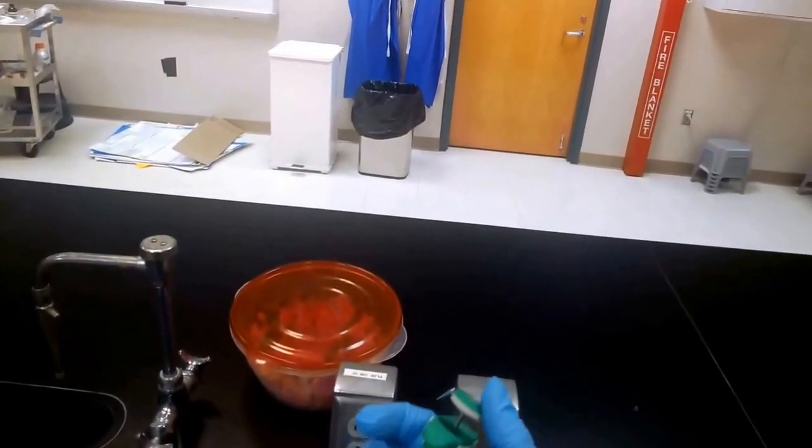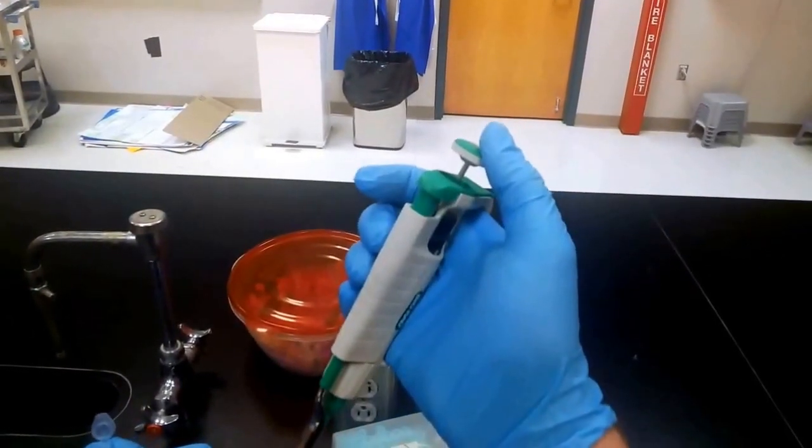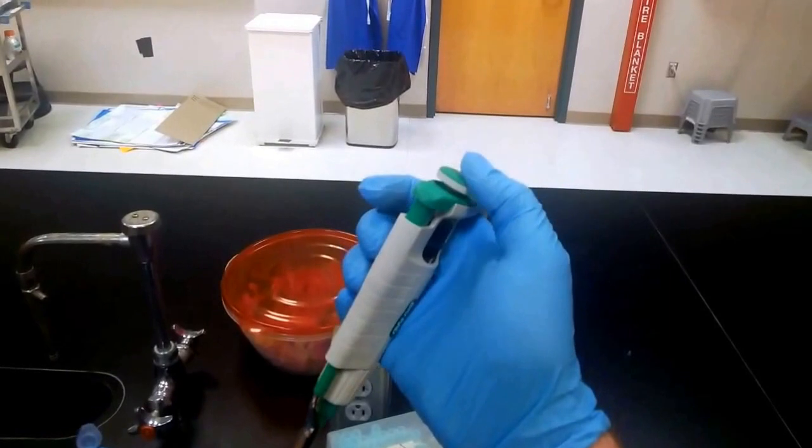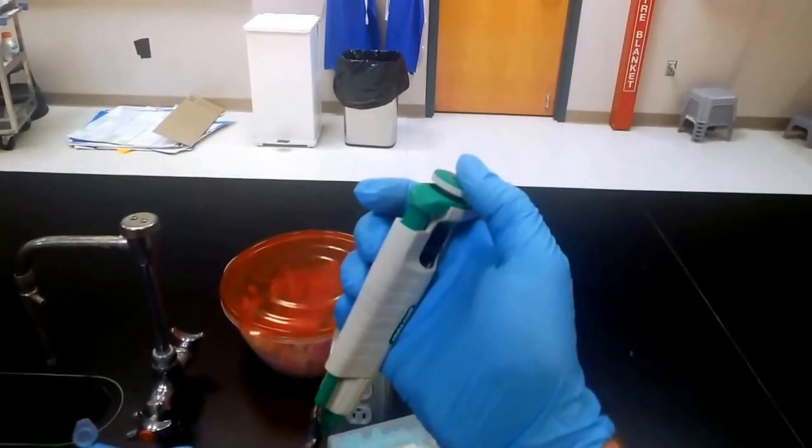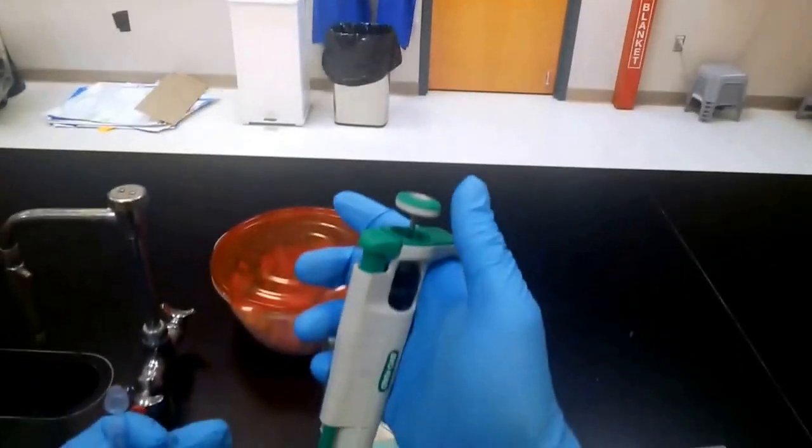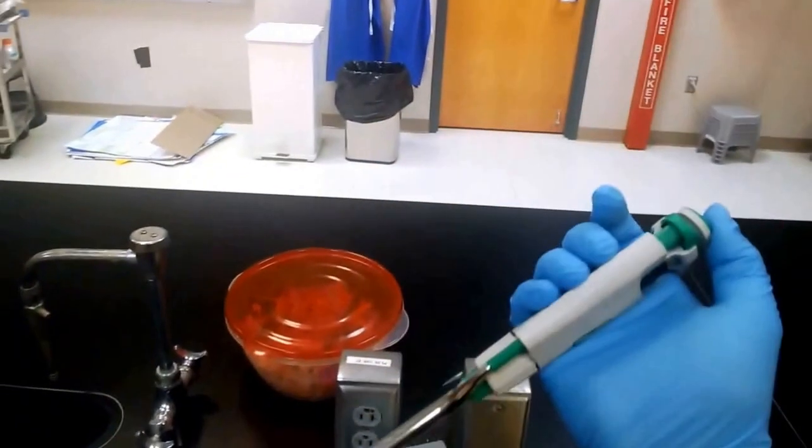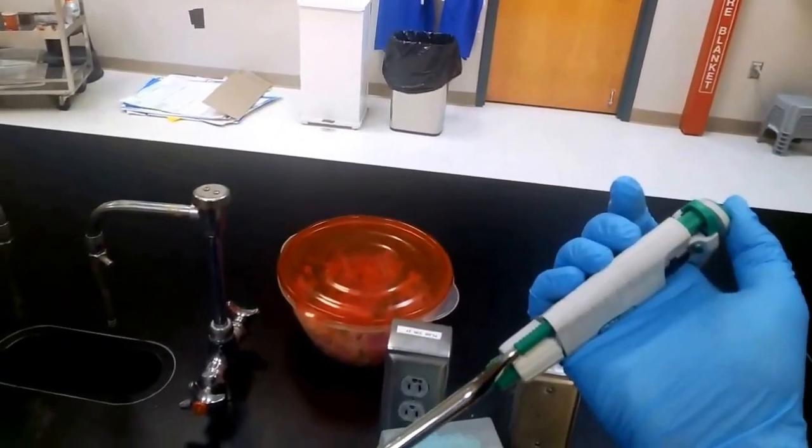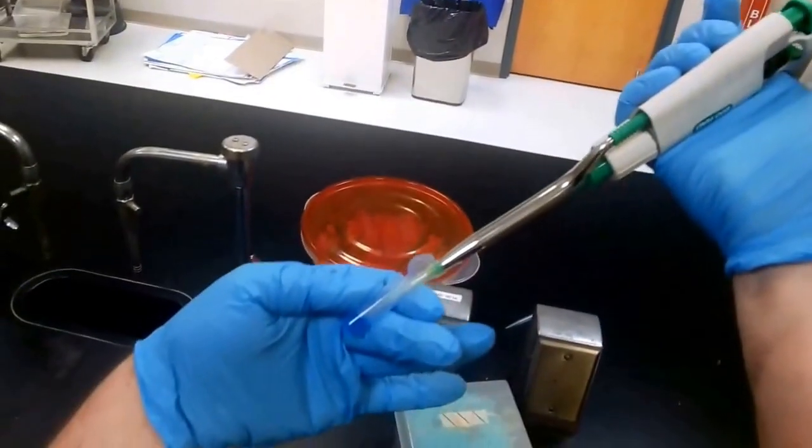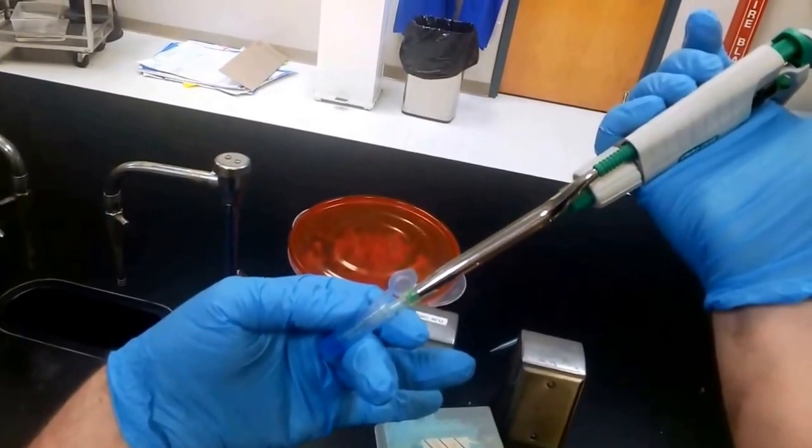And we will now use the button to extract 75 microliters. Now the button has actually two stops—there is one stop if you just press down, but there's a second stop. The correct measurement is acquired by pushing the button down to the first stop, then we will dip the tip into the solution that we're moving and slowly pull up.